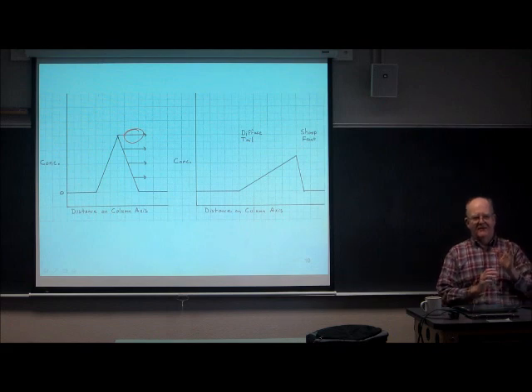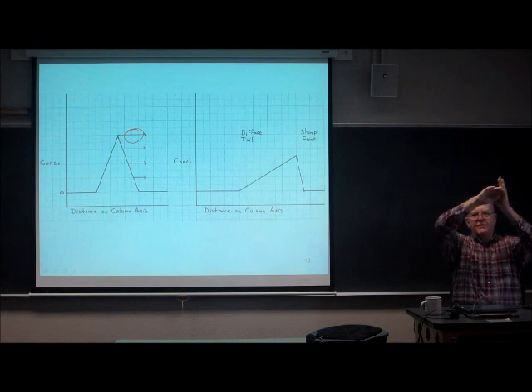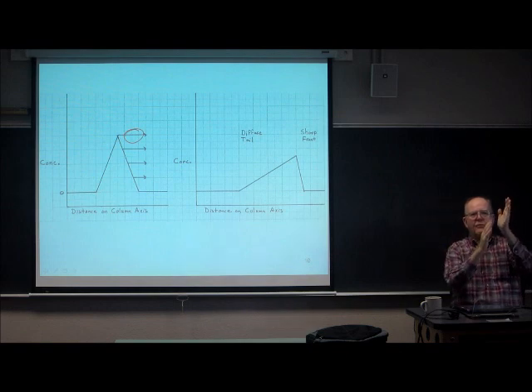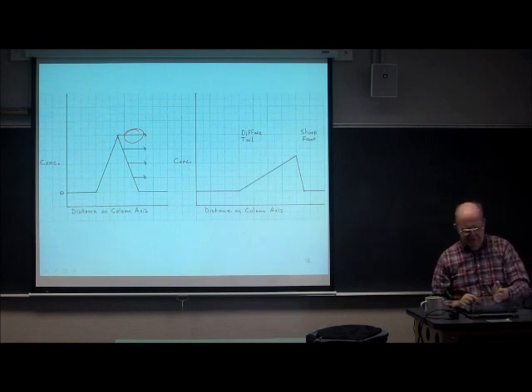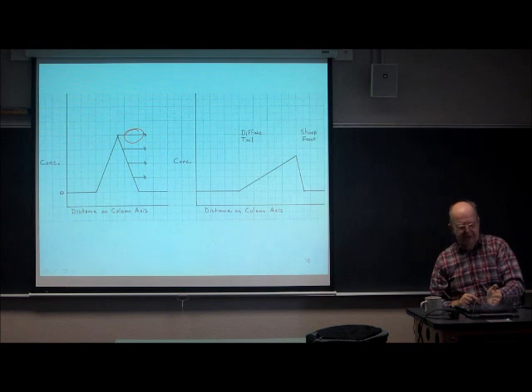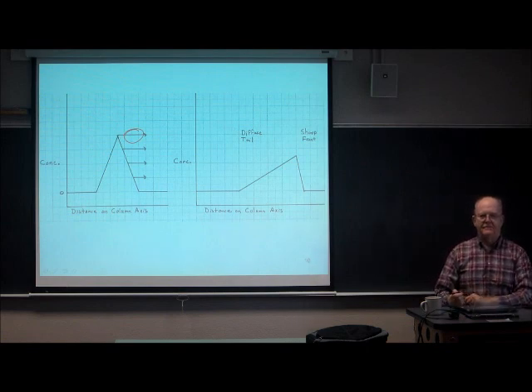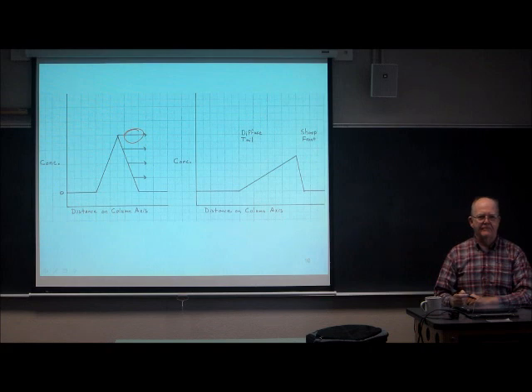So now, imagine that you're in this peak, and you're at the top of the peak. You're moving forward rapidly. The guys lower down on the peak aren't moving as fast as you're moving. What's going to happen is that this front is gradually going to become vertical. It's going to look like that. So the peak now looks like this inside the column.